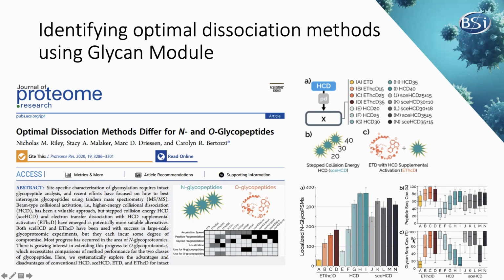They look at the number of possible glycosidic bonds that could be fragmented, and this percentage represents the number that were observed. And so for EThcD, it actually outperforms HCD for the most part in being able to cover most of the peptide sequence and glycan sequences, which helps in terms of localizing the glycan to the correct glycosylation site.